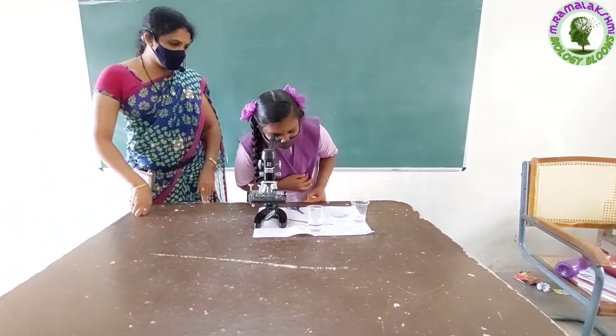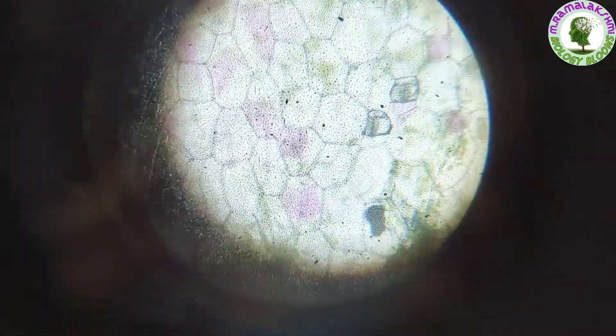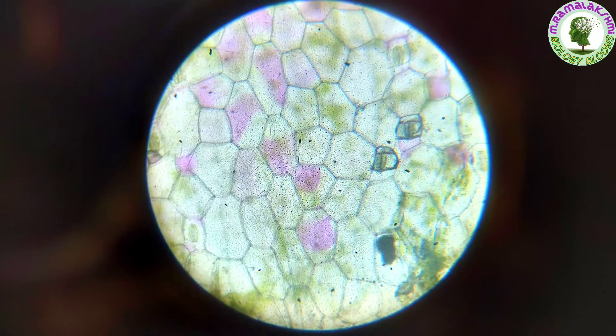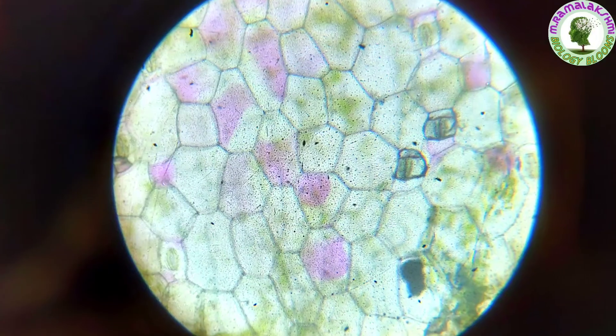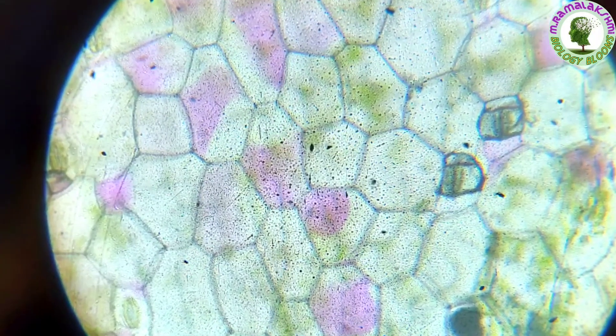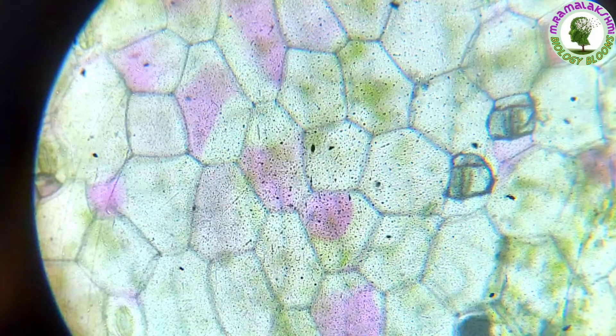Monika, do you find any differences from the first observation? Yes, ma'am. The purple colored matter is shrunken, ma'am. Yes, Monika. When we put salt solution over the peel of the reo leaf, the water inside the cells comes out. This results in the shrinking of the cytoplasm along with the cell membrane. This process is known as plasmolysis.